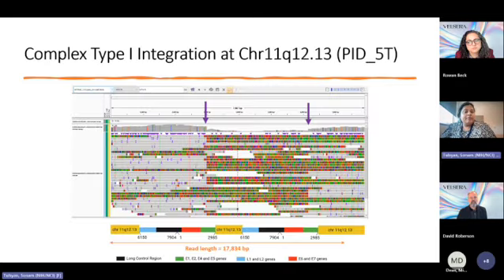We found 2 samples to have integration. Out of those 2 samples, one had type 1 integration and one showed type 2 integration. Type 1 integration was found at chromosome 11q. The purple arrows highlight the breakpoint junctions, and the map also shows that the chromosome 11 integration took place at base 6,150 of the HPV genome, and the right junction is at 2,985 bases.